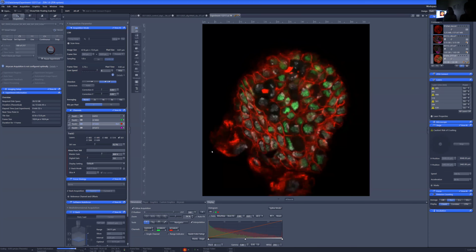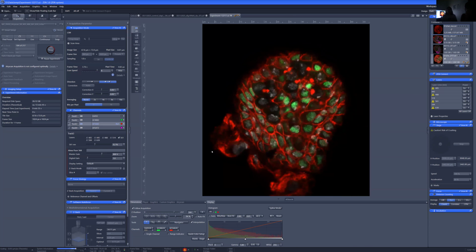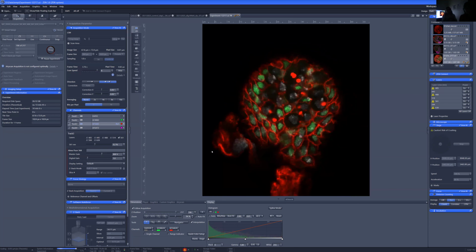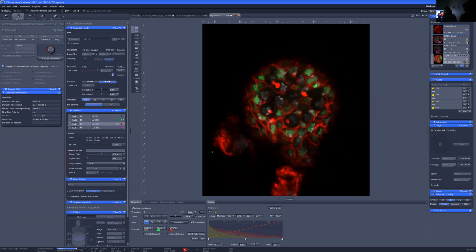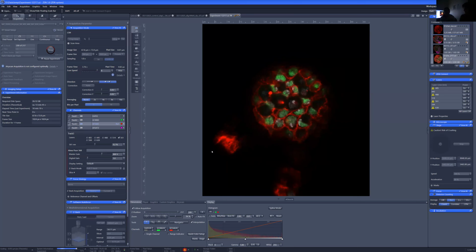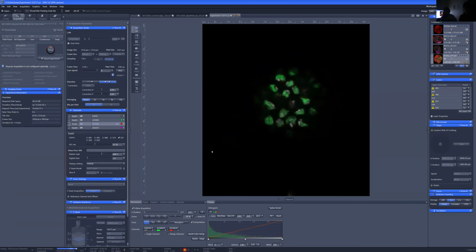And when you start operating this giant microscope, it generates a lot of heat. Temperature causes glass and metal and lots of things to expand when they get hot. So the room was heating up so quickly that everything was expanding and moving. Especially when you're working with something that sensitive, any small expansion can totally mess it up. Yeah, it was bad. I remember it being bad.